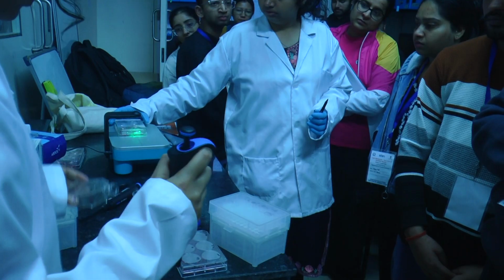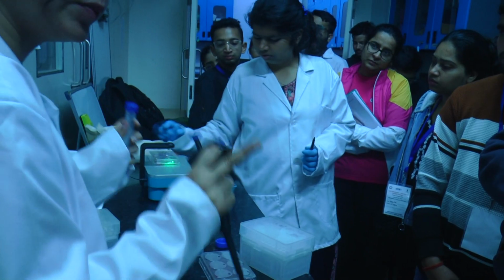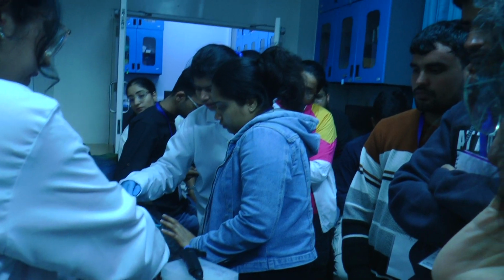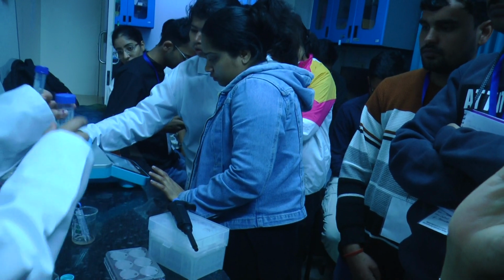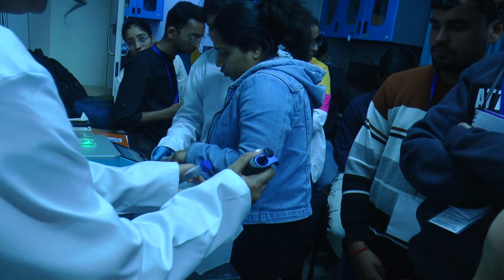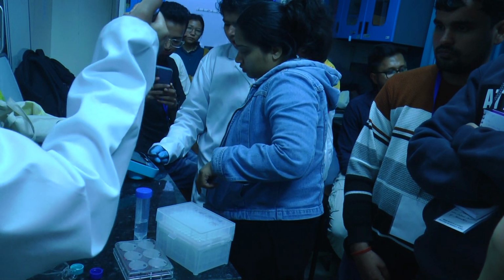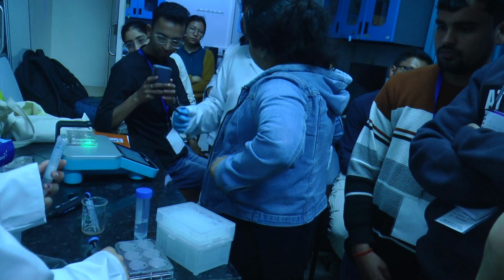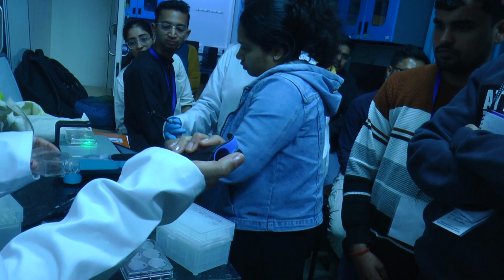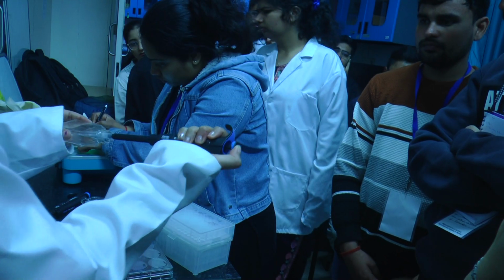Now the next step is the active vesiculation buffer, which has DTT and formaldehyde, which we prepared today itself. The base of that is the vesiculation buffer, not water: DTT plus formaldehyde in vesiculation buffer. So here I am adding that. I'll take 1 ml, which is enough for this 25 square centimeter flask. I'll add it slowly and uniformly so that it covers the whole surface.